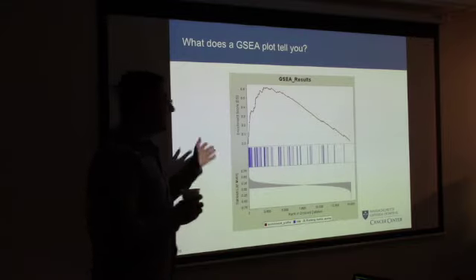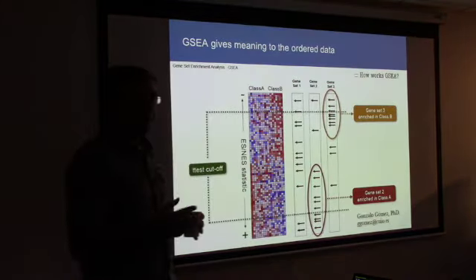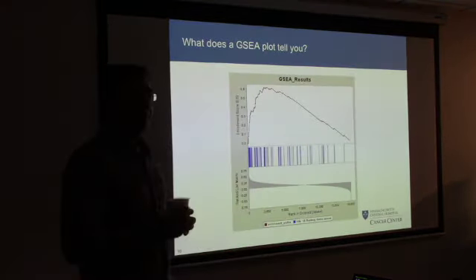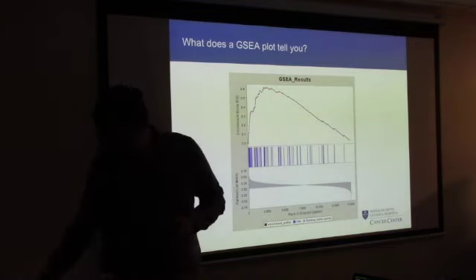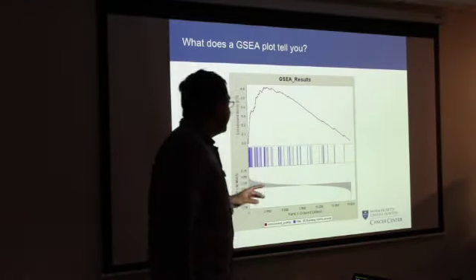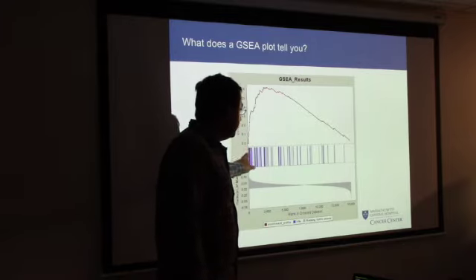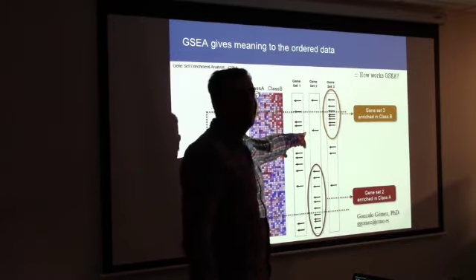Now, how do these results stack up against here? Can you see how this and this are actually the same thing? Sort of? No? So it takes a little adjustment in your eyes, but basically, if you were to look at everything below this line, then these bars here are the same as these arrows here.